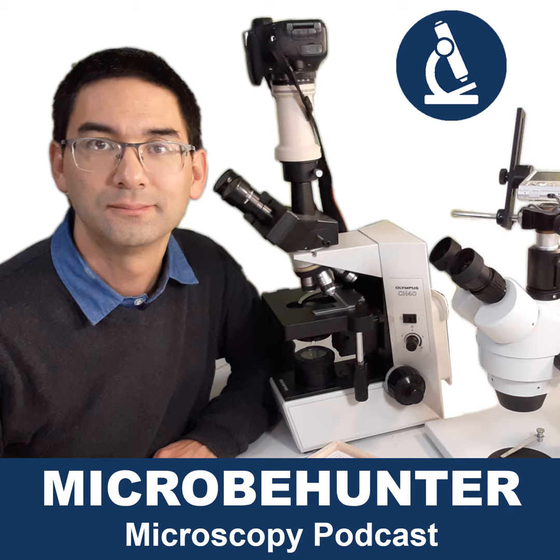So the diagnosis of what it is should always be at the end, and not right at the beginning. What you might be trying to do is you already formed your conclusion that you have a parasite, and now you try to find evidence for this. But that's not the way that science works and the way that you should do it, because then you go in the direction of what we call confirmation bias.